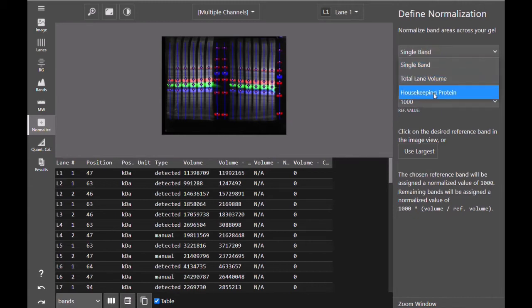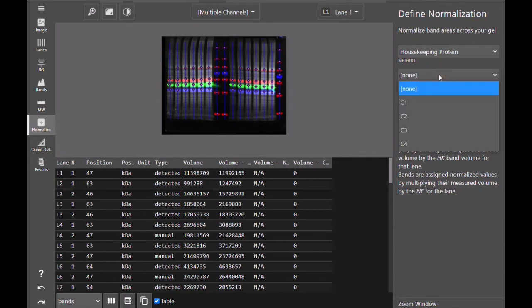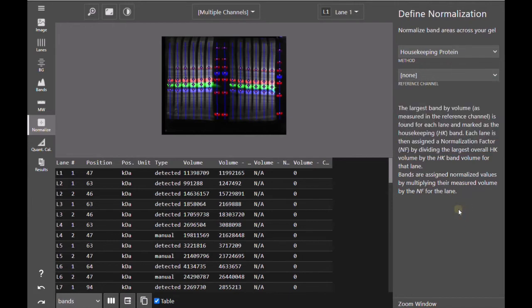With housekeeping protein normalization, you would select the channel that contains your housekeeping protein as your reference channel. The software will determine the largest volume band in each lane in the reference channel and will assign that as the housekeeping band for that lane.